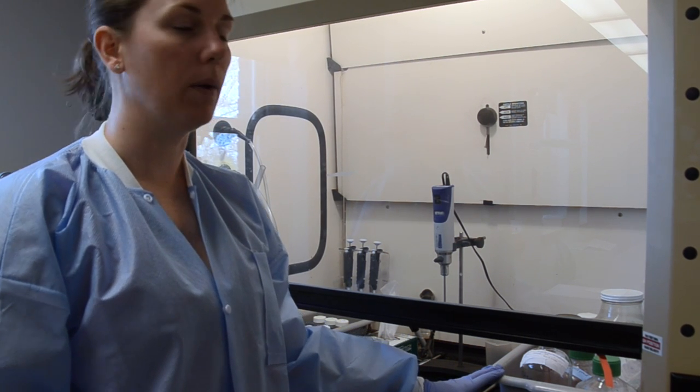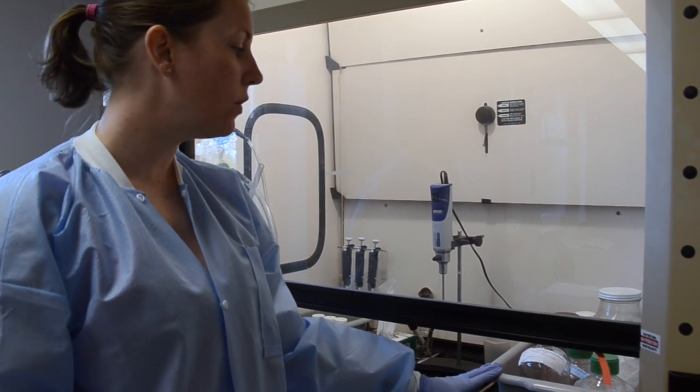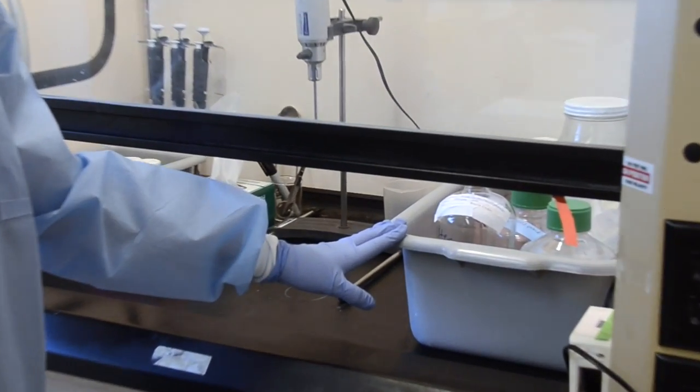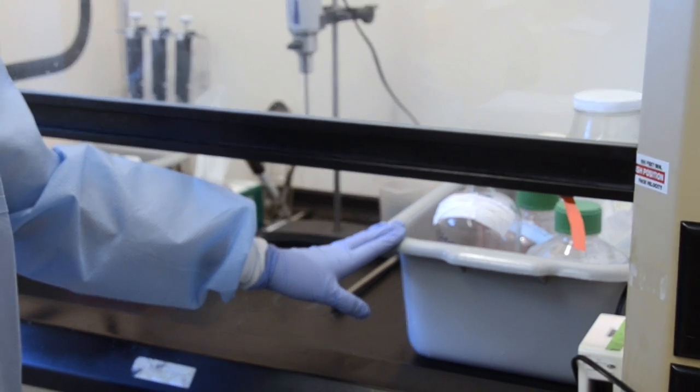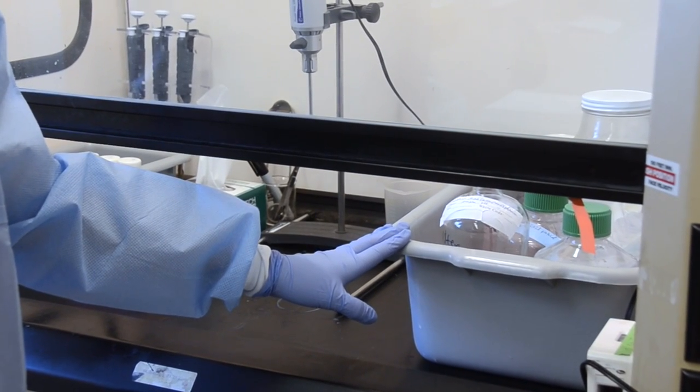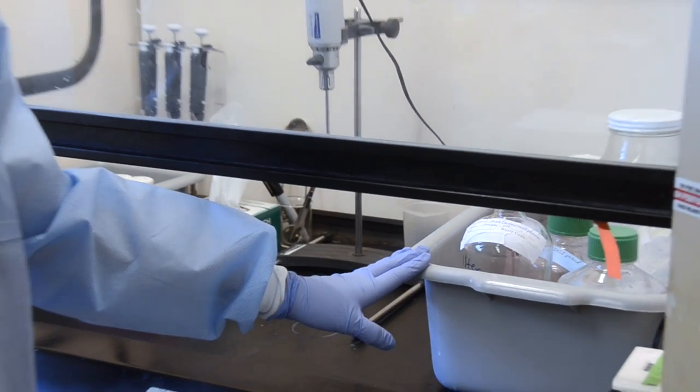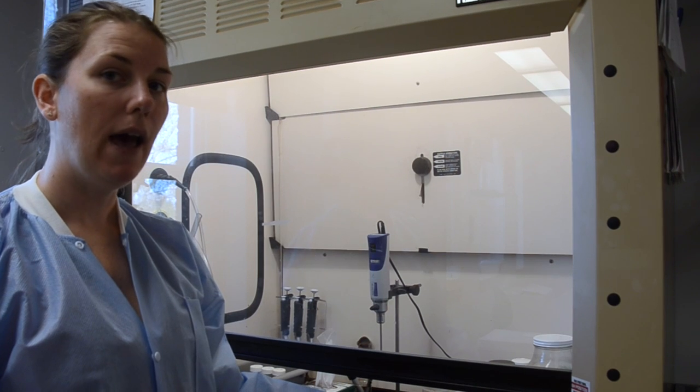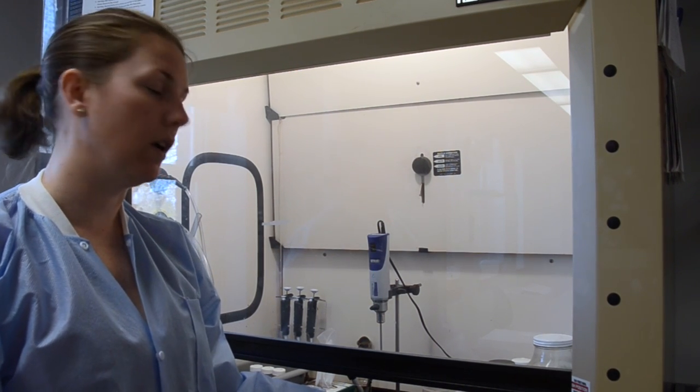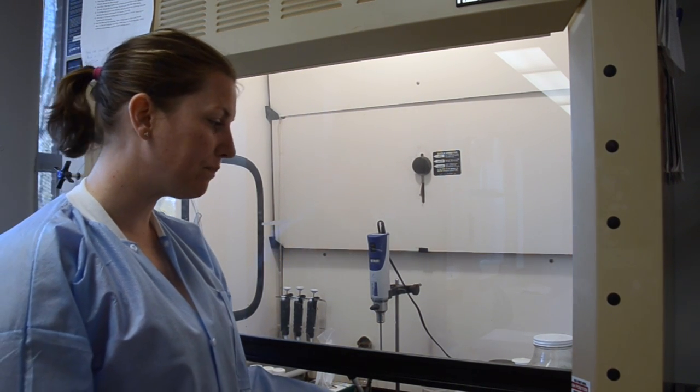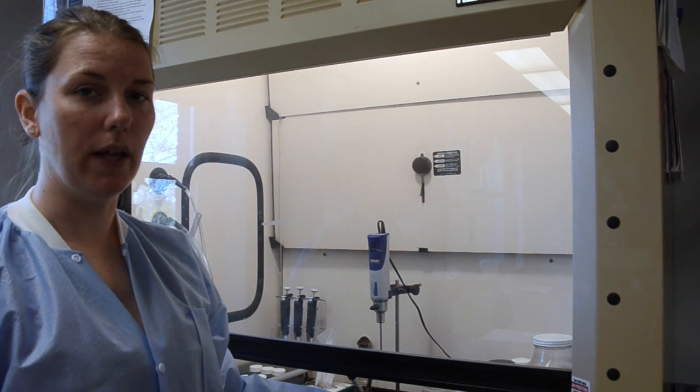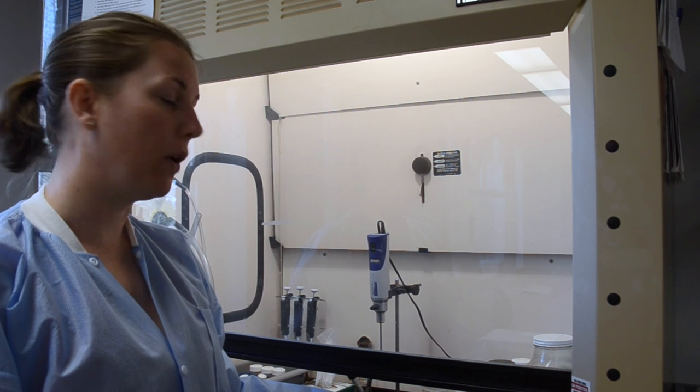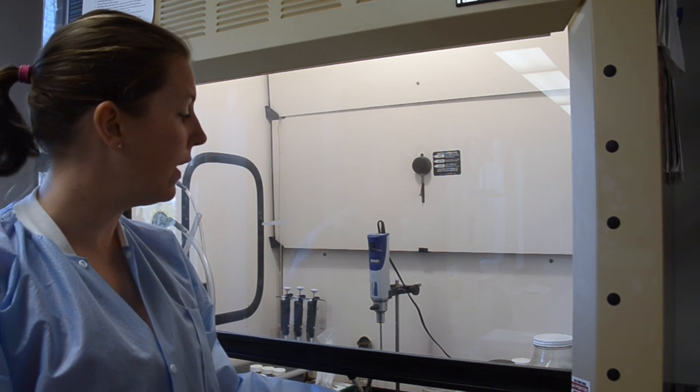Each of those chemicals is labeled, so please do not mix waste. If you have a question about where to dispose of your waste, please ask. If a waste container is full, you need to let me know as well as Mary Hughes, who is our chemical safety officer. The waste in here is both liquid and dry waste, so it is particularly important that you do not mix those two things.